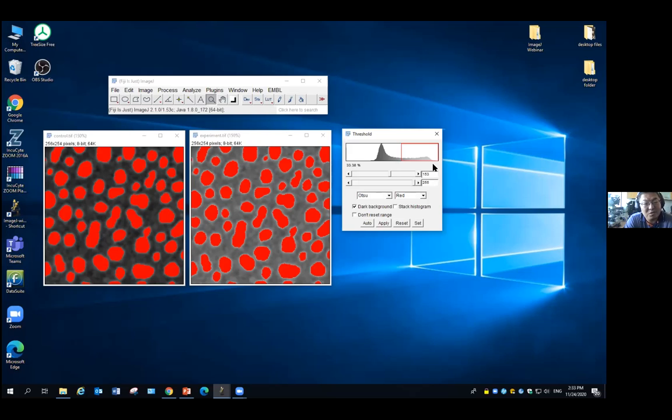we do not go with a fixed value. It's not because it's not good or something, it's just not a practical way in the majority of cases. That requires all your images to have the same staining condition and the same acquisition condition. And in many cases, your control and the experiment, you just cannot keep the same. So many times you can see the background change just by how they change the sample condition, and the staining somehow changes.